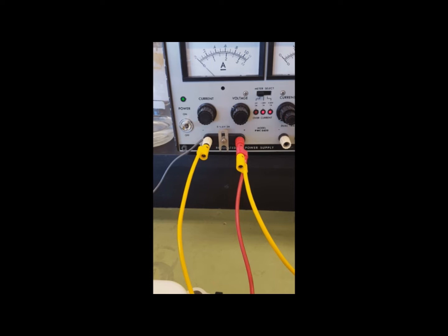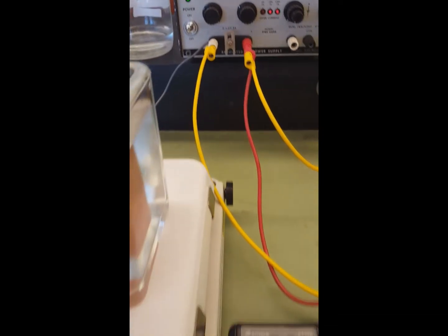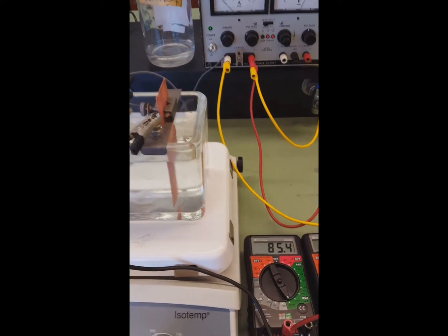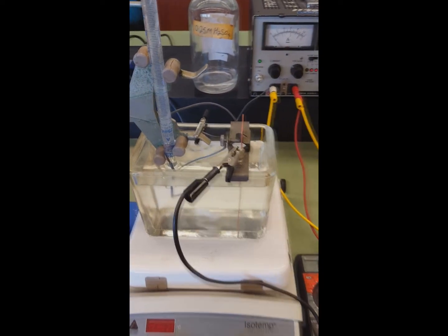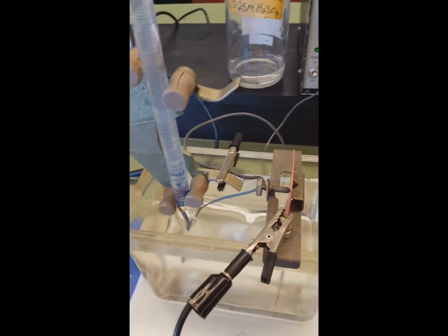And again, the gray insulated copper wire is connected to the negative terminal of the power supply, and that wire goes into the bottom of the burette. Now we'll pause it here. So I see a fairly steady stream, or evolution, of hydrogen gas at the copper wire cathode. You want to make sure that the wires are completely inside the burette, otherwise you'll lose some hydrogen gas to the atmosphere, and that would be a disaster for your results.